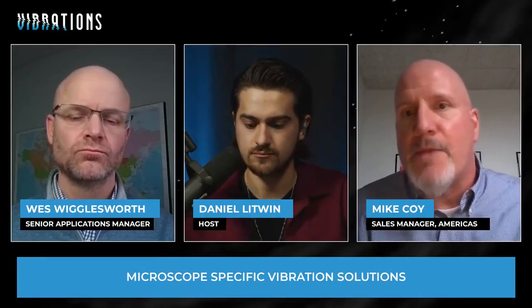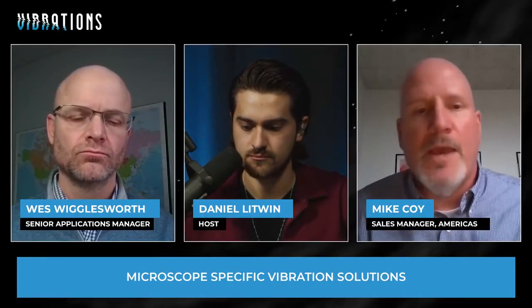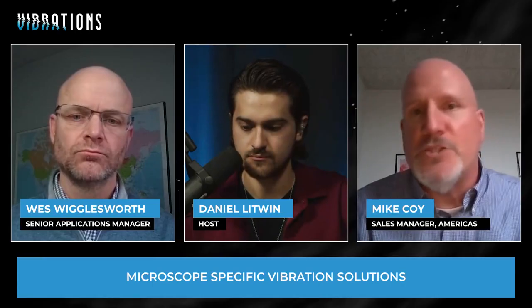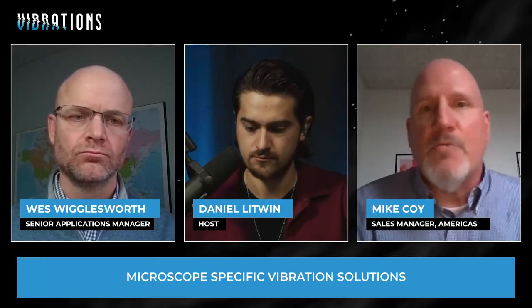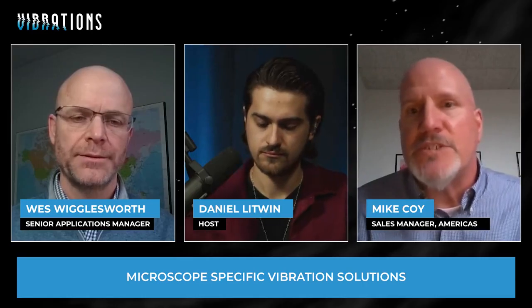One of the interesting stories is just watching how important vibration management has become as the equipment has gotten better and better over the years. So just for a quick example, cryo-EM, everybody talks about how critical cryo-EM is for handling these new viruses, for dealing with drug discovery. But this is a technique where we're averaging thousands of images together. And a requirement like that really starts to push the need for extreme levels of vibration control.